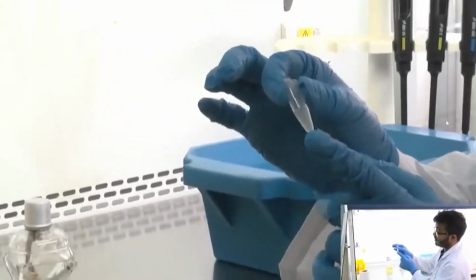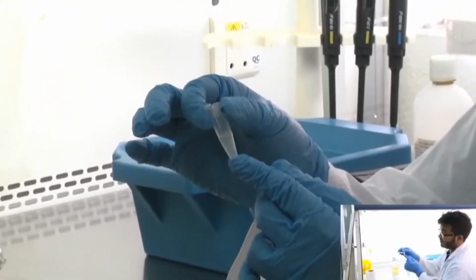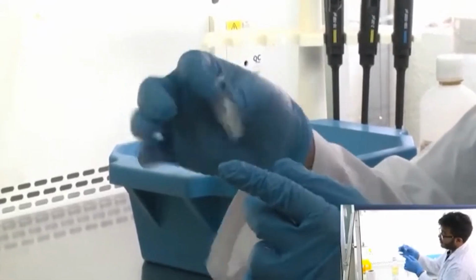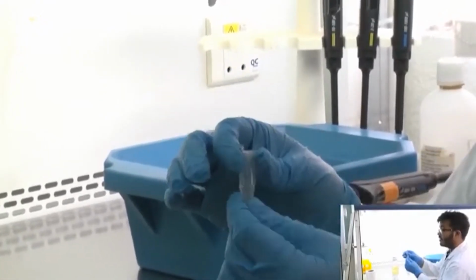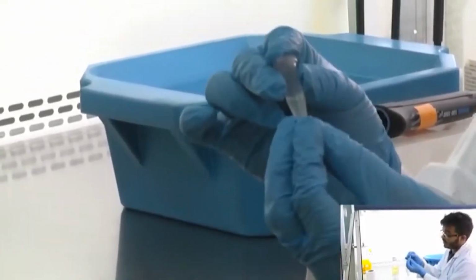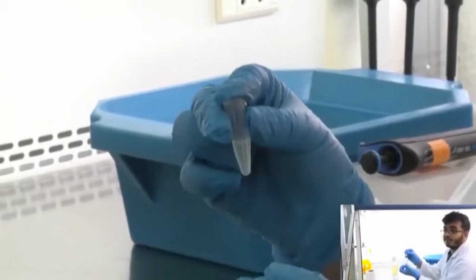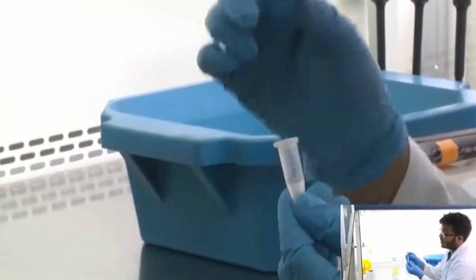If you can see, it's slightly turbid because there are already 50 microliters of bacterial cells to which we've added media, and after 1.5 hours of growth at 37 degrees centigrade, there will be a much larger population of bacteria, so there is some growth and proliferation.